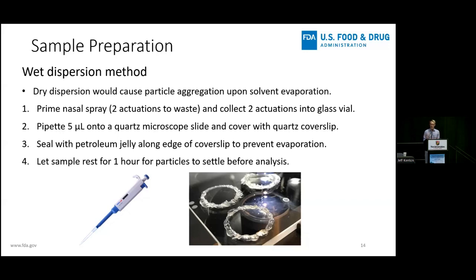That's not to say that you can't use this on DPIs. There is a separate instrument that allows you to load powder and have a puff of air disperse that powder and allow it to settle onto a glass slide. And that works really well for separating out particles onto a glass slide.